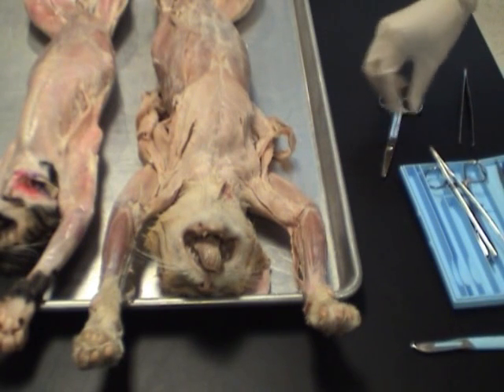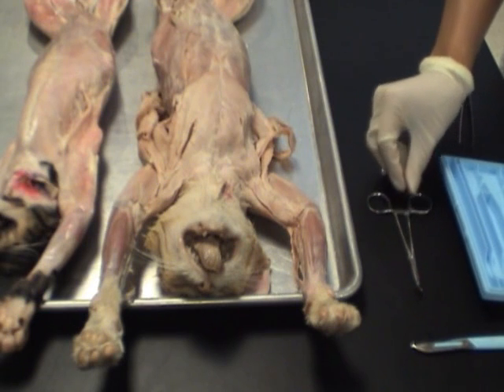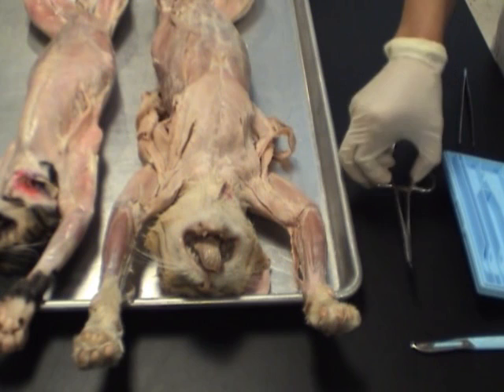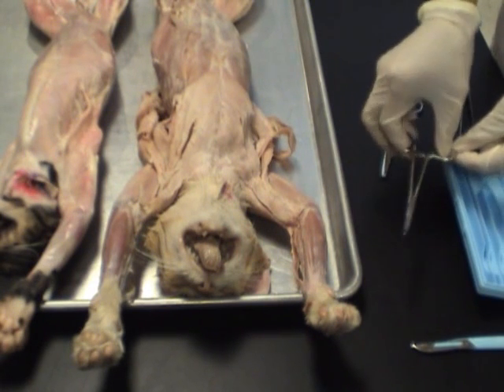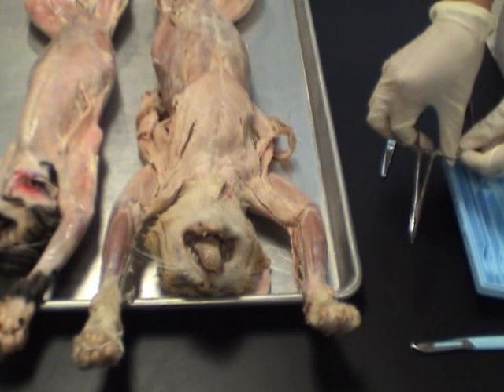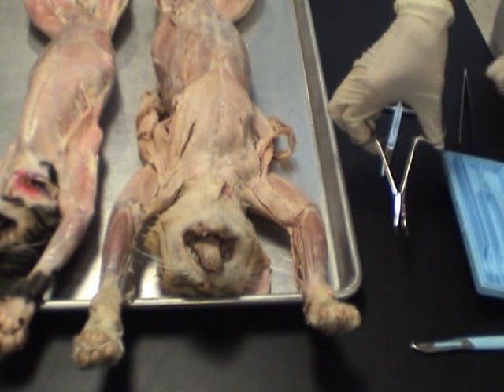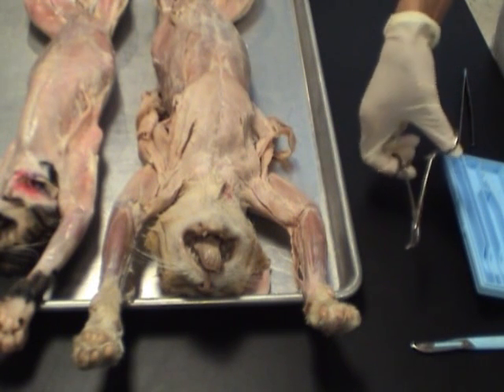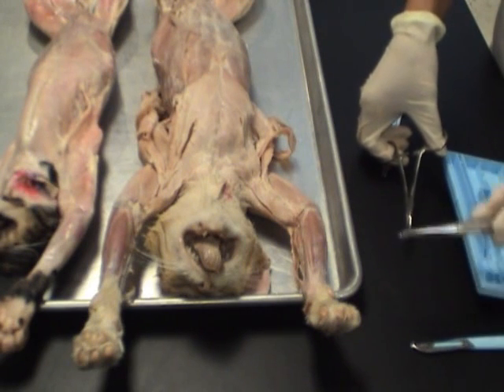One last instrument I want to point out is this one right here, and this is the hemostat. It looks like a curved pair of scissors. If you notice, it's curved at the end and has holes for your fingers to go through. The difference between this and scissors is that this is not a cutting instrument. This is a holding instrument.